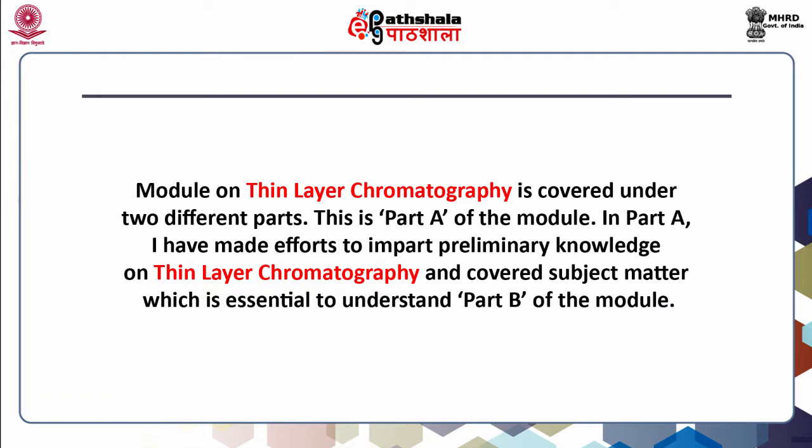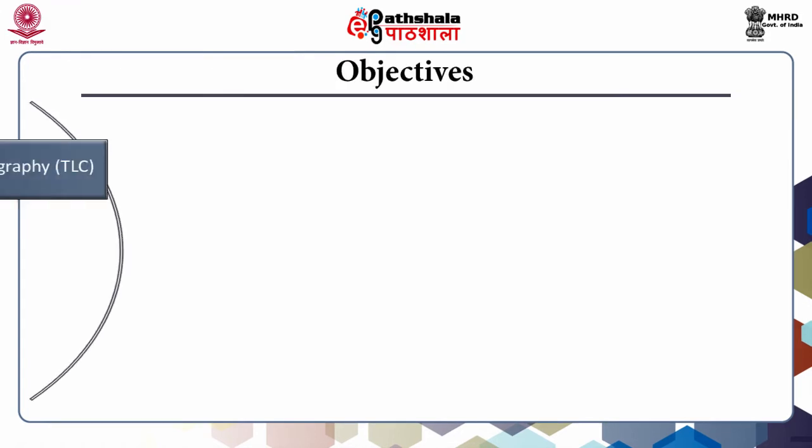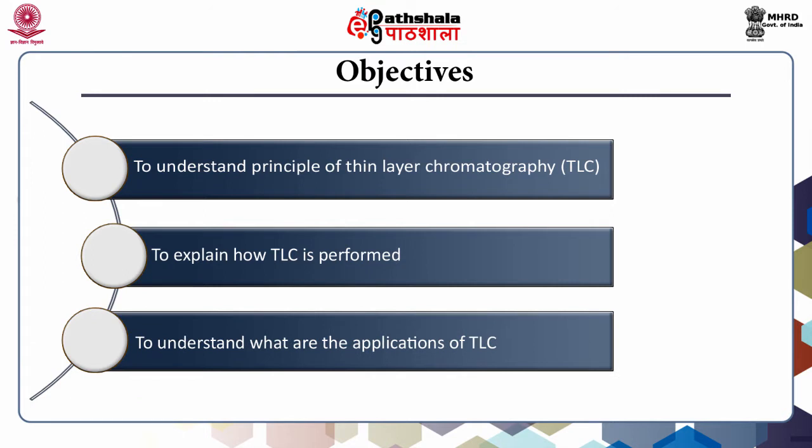The module on thin layer chromatography is covered under two different parts. This is part A of the module. In part A, I have made efforts to impart preliminary knowledge on thin layer chromatography and covered subject matter which is essential to understand part B of the module. So, in this module, we will learn about the principle of thin layer chromatography, then how TLC is performed, that covers the practical aspects, then advantages, disadvantages and the applications of thin layer chromatography.